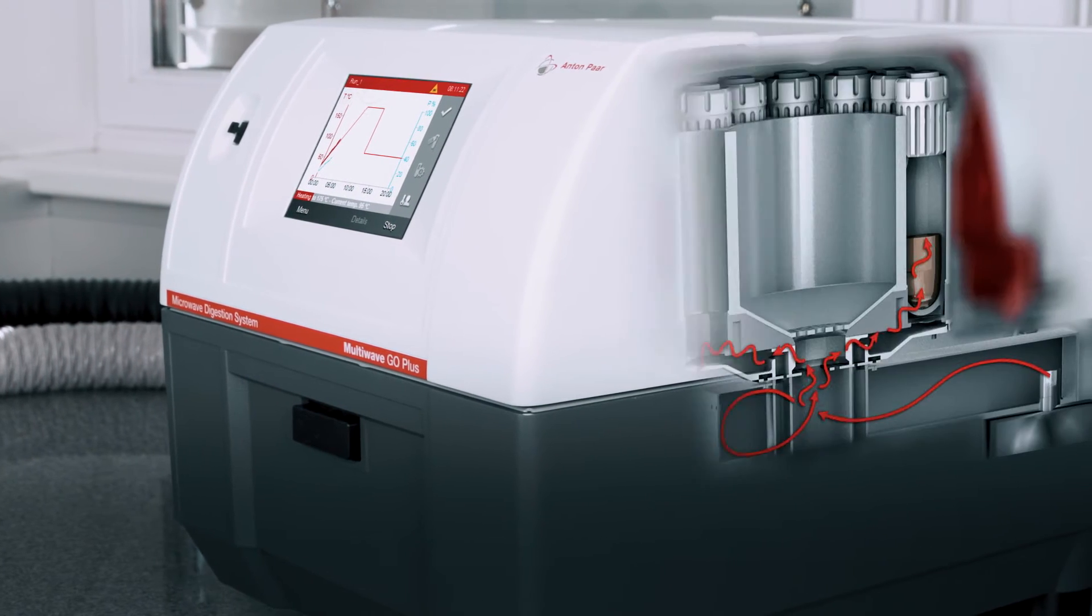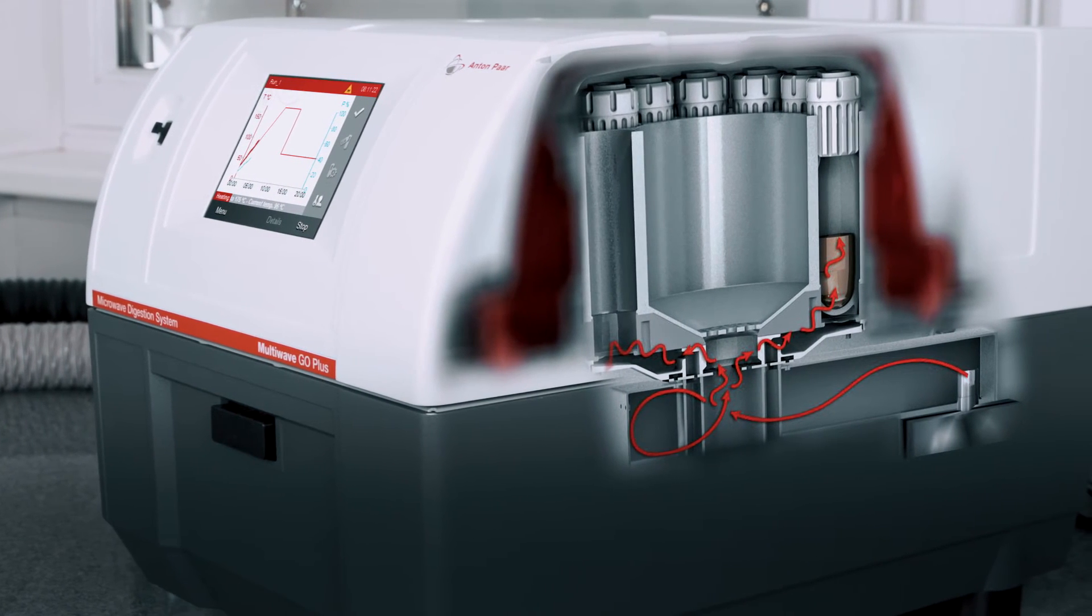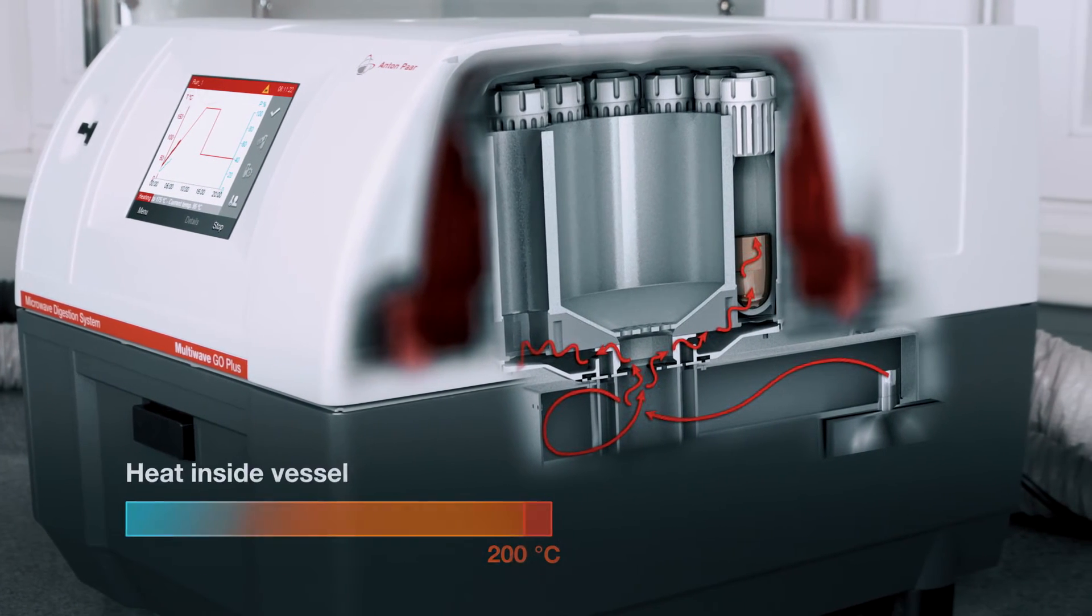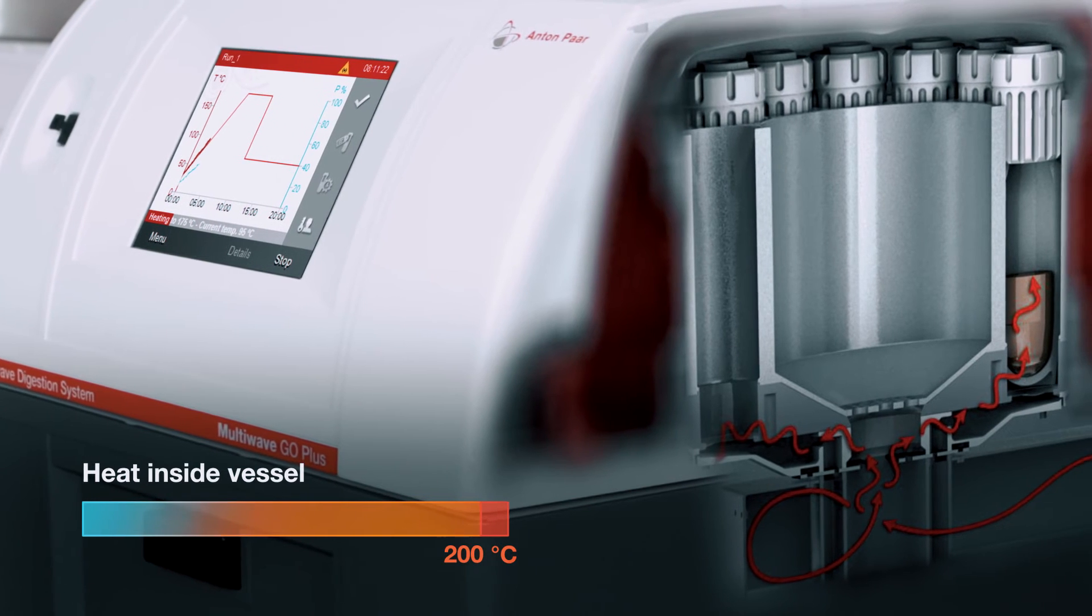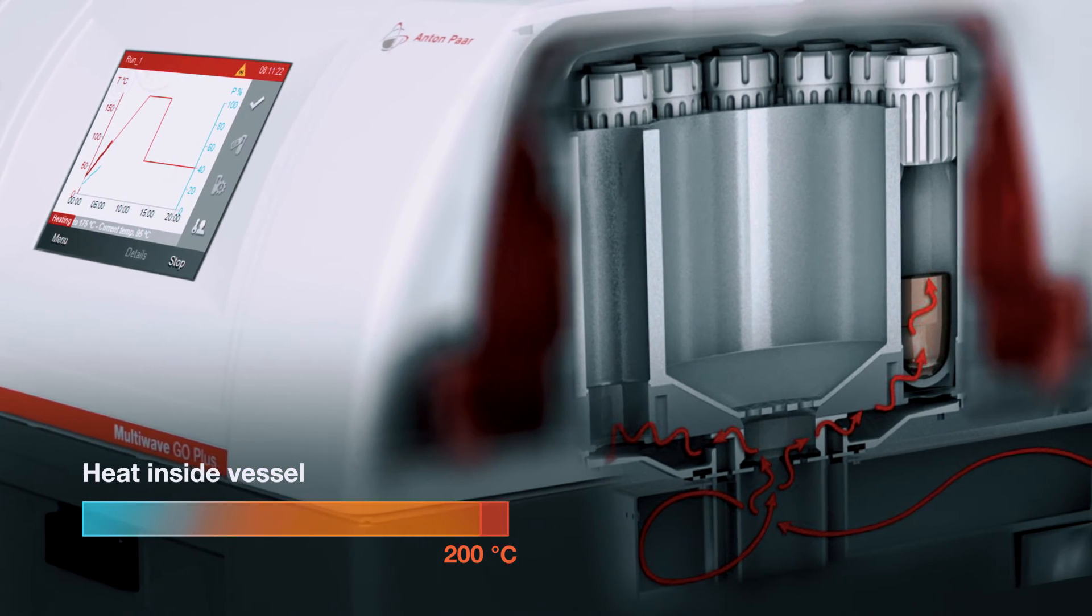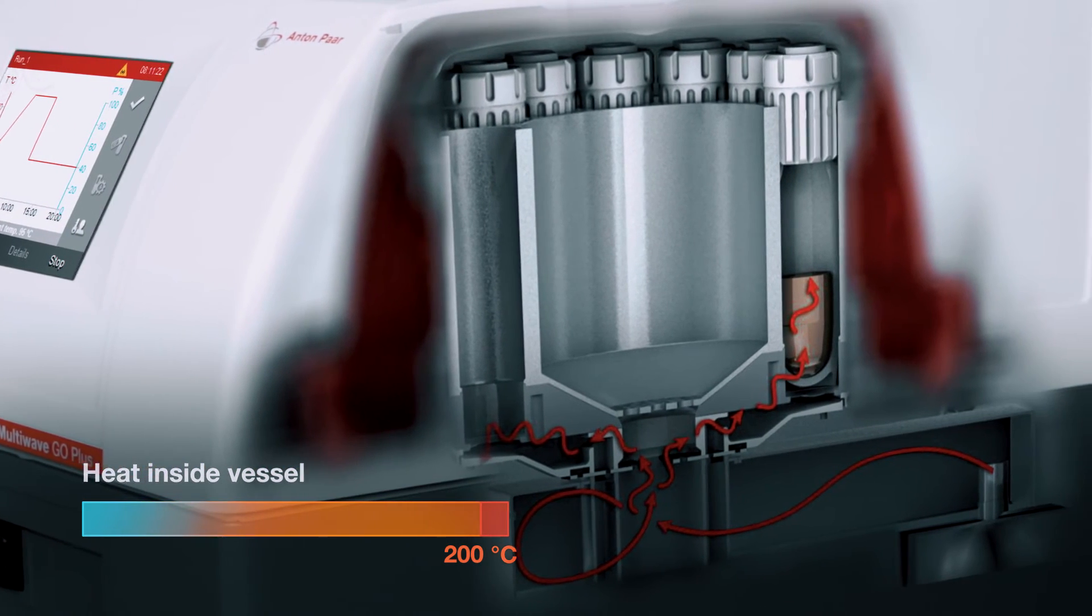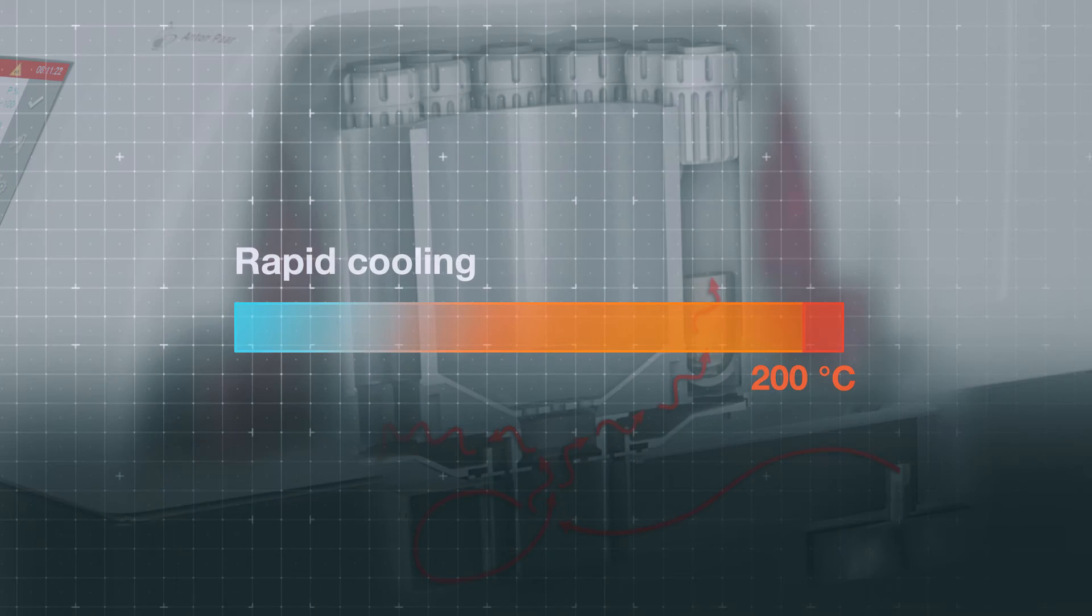The microwave comes in from below and is targeted at the vessels, producing heat up to 200 degrees centigrade. The instrument's sophisticated design ensures microwaves target only the liquid, nothing else.